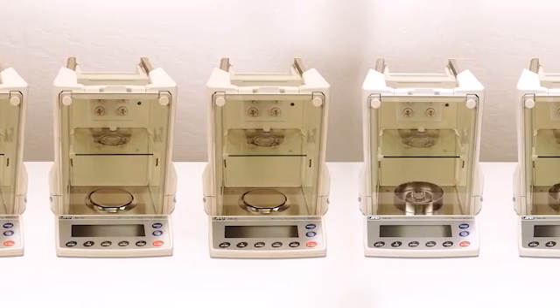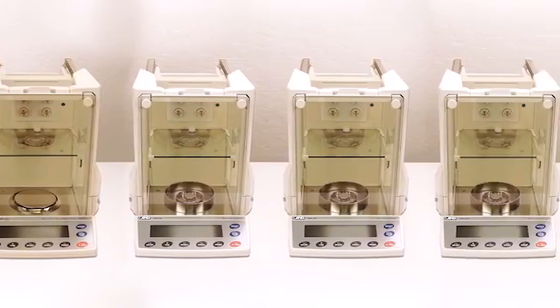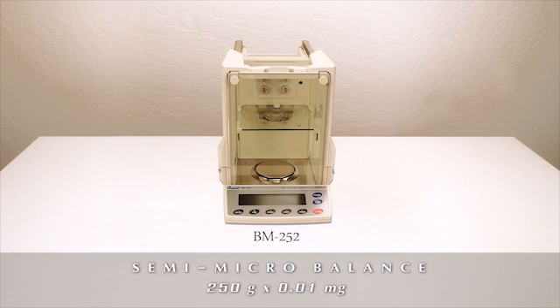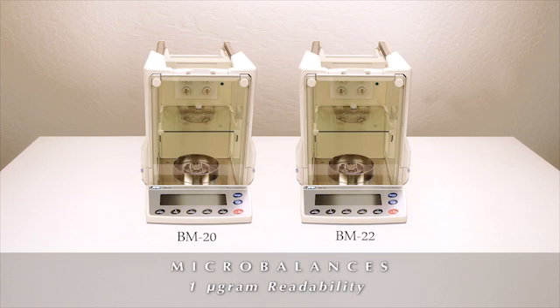The ION series consists of six new models: three analytical balances with capacity up to 520 grams, a semi-microbalance, and two microbalances, including the BM20 with its 22-gram capacity and one microgram resolution.